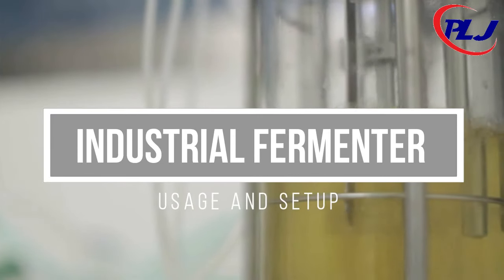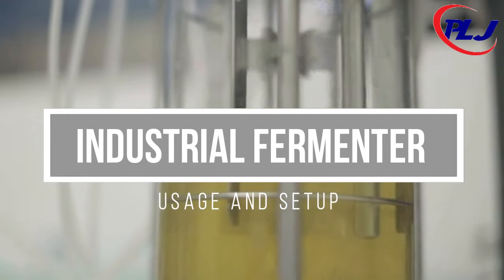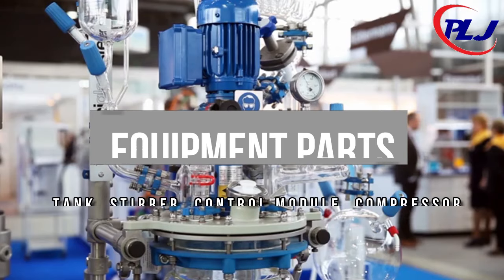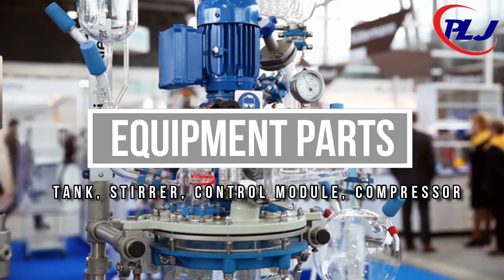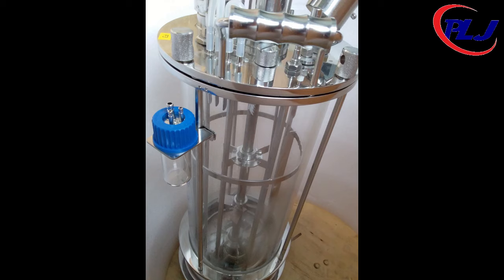One of the fermenters currently being used is the stirred tank bioreactor. Let's take a look at how it is set up and operated. Parts. The fermenter consists of multiple parts. First, we have the vessel, which is made of borosilicate glass.